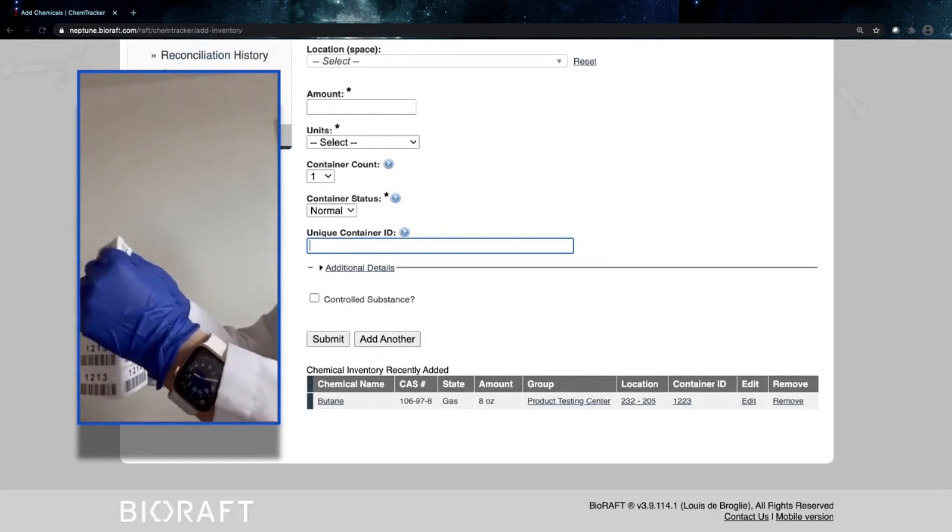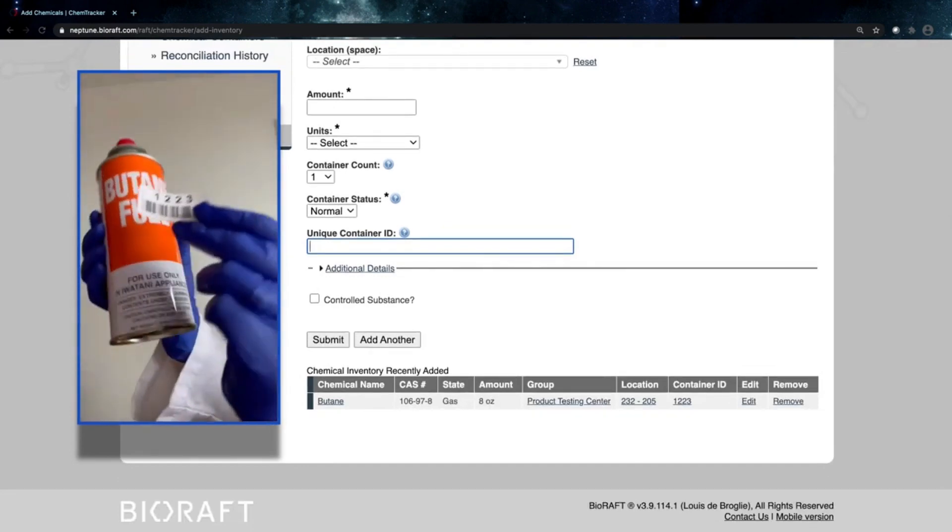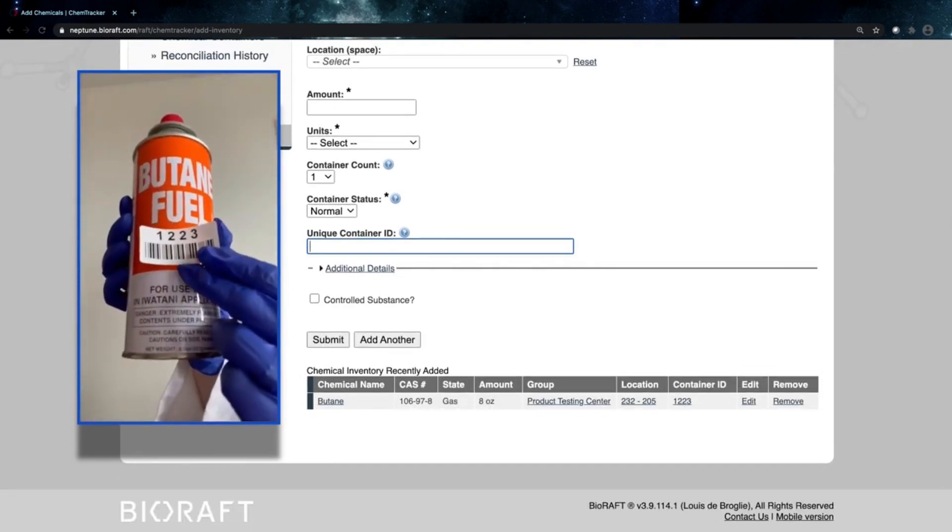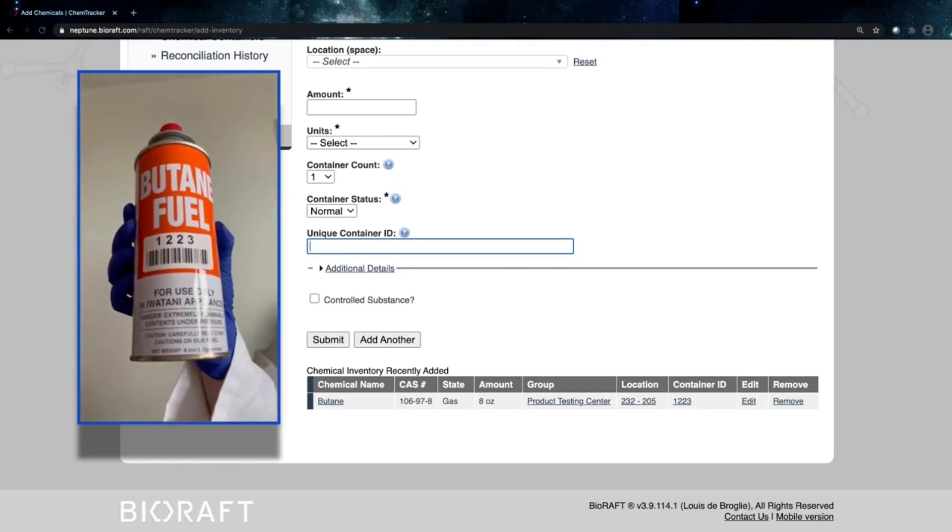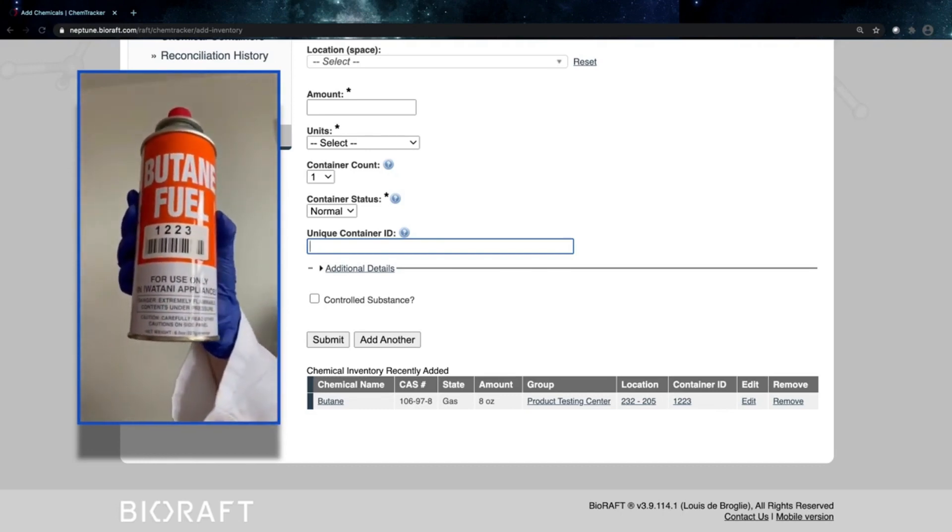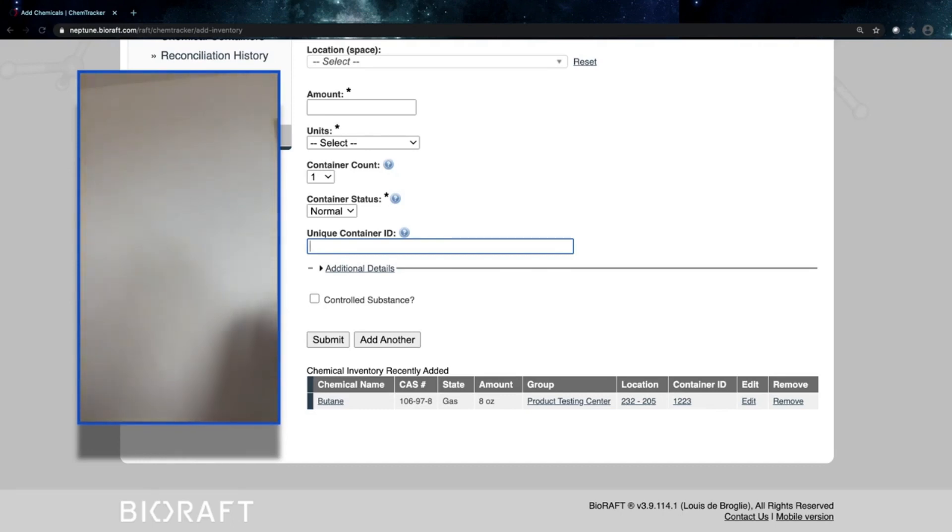I'll then peel that label off and go ahead and attach that to my chemical container. And our inventory is already in.